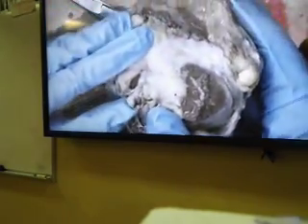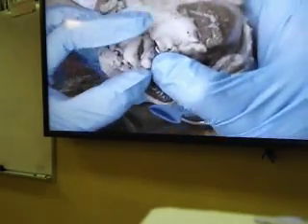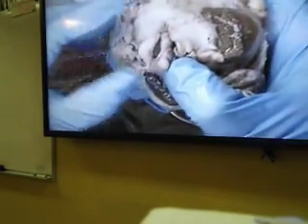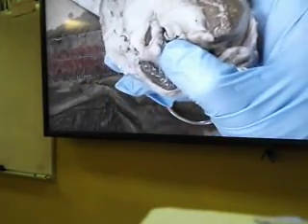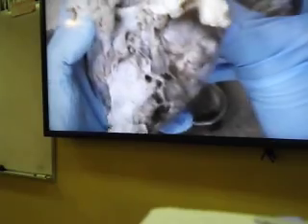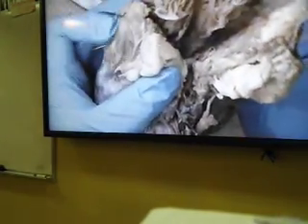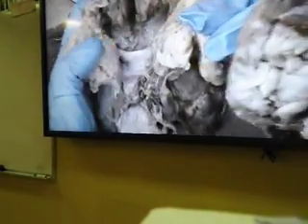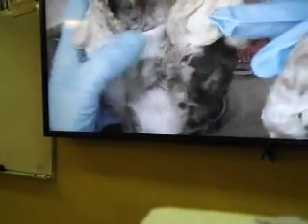You can recall we saw the optic nerve last lab as well, when we saw the sheep brain, and we saw that the optic nerve, starting from the right eye, and this is from the left eye, comes together into the thalamus area to make the optic chiasm.